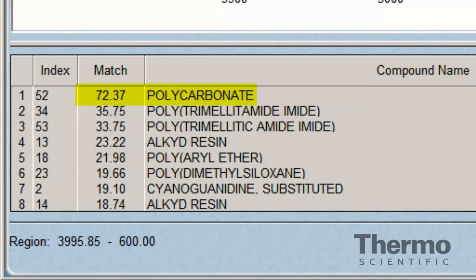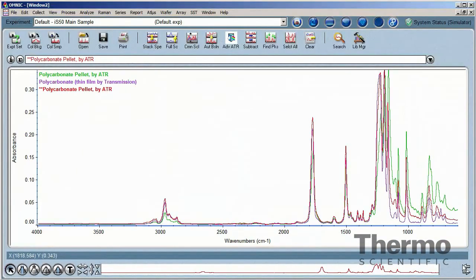The ATR experiment can be a useful analysis approach and offers many advantages. Little or no sample preparation is needed, system purge is more consistent, and quantitative experiments are simpler, to name just a few. An understanding of the limitations it brings with the advantages it offers needs to be considered. Surface modifications or inhomogeneities in the sample can cause variations that are different than the majority of the material. Only the near surface of the sample is analyzed, which can result in misleading identifications if the surface is not representative.